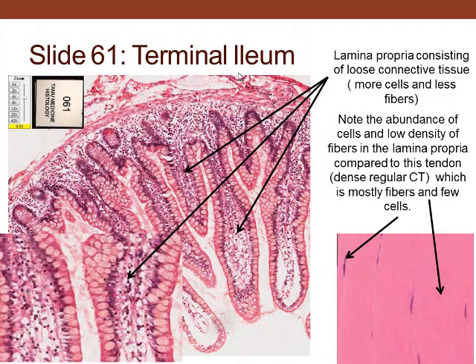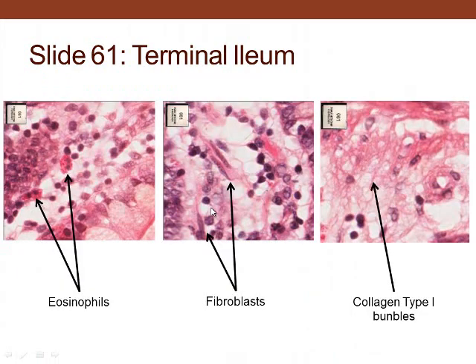Looking at the lamina propria, it supports the epithelium on the surface. We see simple columnar epithelium with goblet cells. The lamina propria, epithelium, and muscularis mucosa together make the mucosa, and below that is the submucosa. In this region we see eosinophils with a lobulated nucleus and big red granules, and fibroblasts — cigar-like cells with a nucleus and cytoplasm extending to either side.